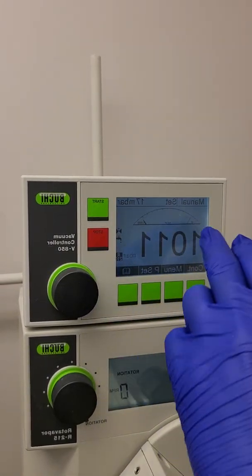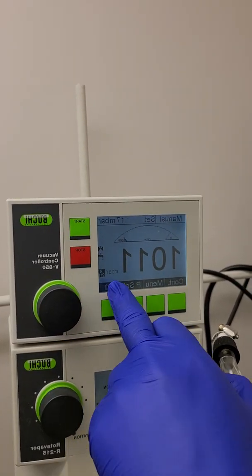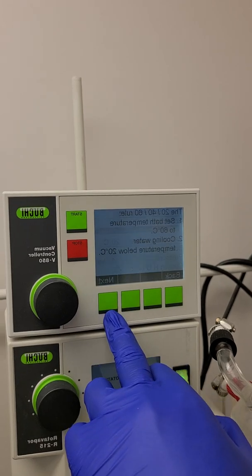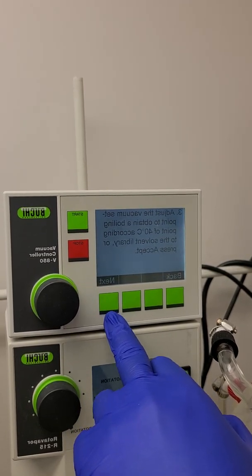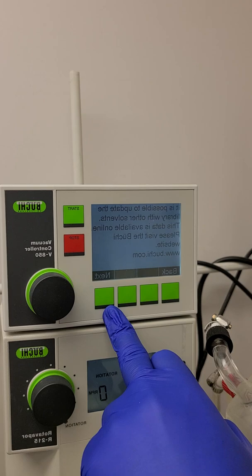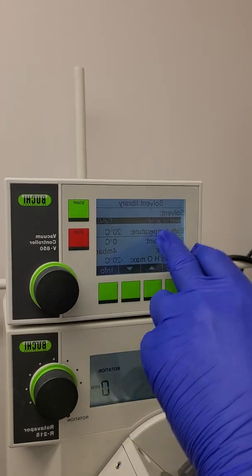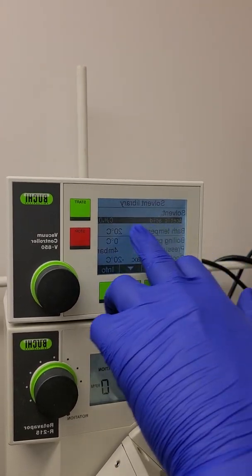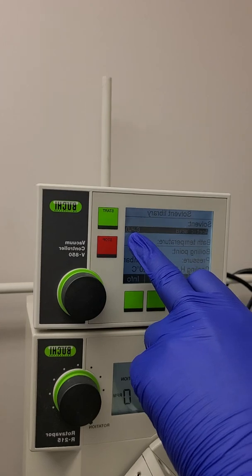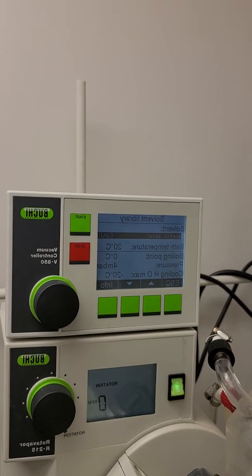So here you can see there's manual sets and there's also presets. This little book here is the library, and it actually will show you different instructions on how to use the machine. And it gives you references on where to find more information online. So here you can see the solvent library, acetic acid. There's lots of different presets you can use. If you know that your solvent is in the preset library, you just click on that and it will start and do the settings that are appropriate for that solvent.